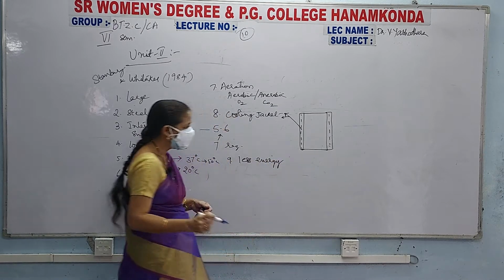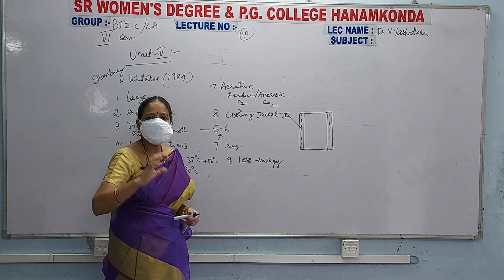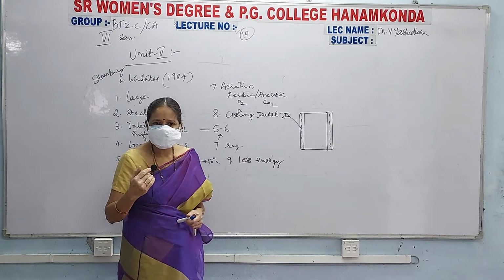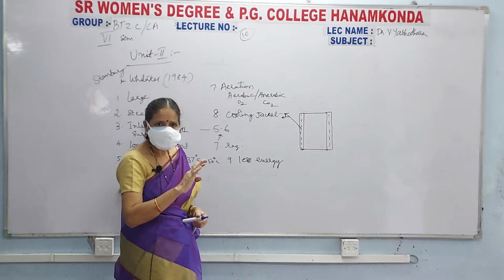Okay, it should work with very little energy. That means it should not consume high energy, so that energy consumption can be reduced in the bioreactor. అంటే ఏంటి, కరెంట్ ఎక్కువ వాడకూడదు.